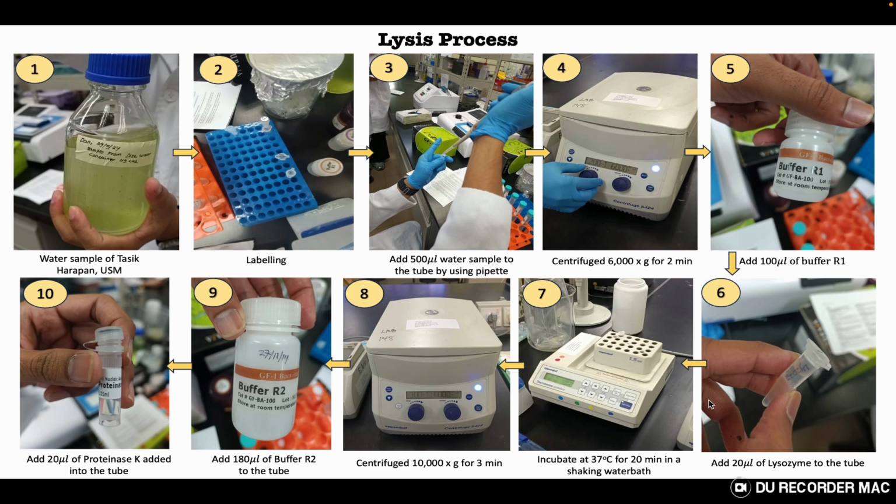Followed by the next step, adding 100 microliters of buffer R1, and in step 6 adding 20 microliters of lysozyme to the tube. The lysozyme's function is to crush the outer cells, breaking them to release the DNA. Step 7: incubate at 37 degrees Celsius for 20 minutes in a shaking water bath.